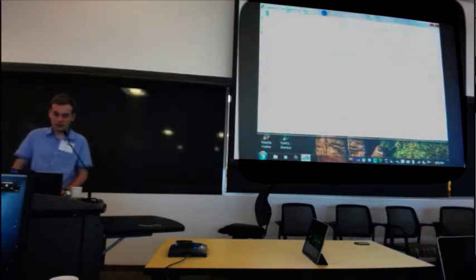The one that needs to be changed is the base file path, which should be changed to CASS tutorial. Okay, only this one.